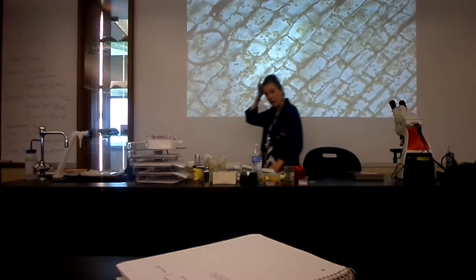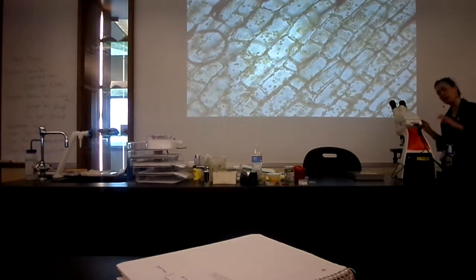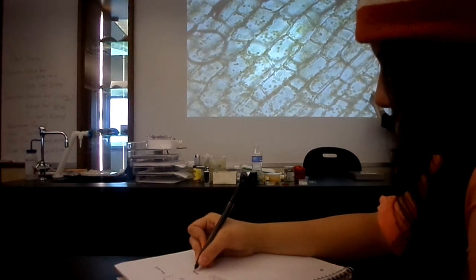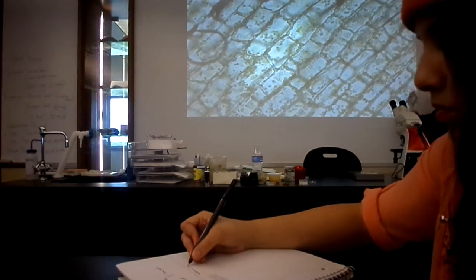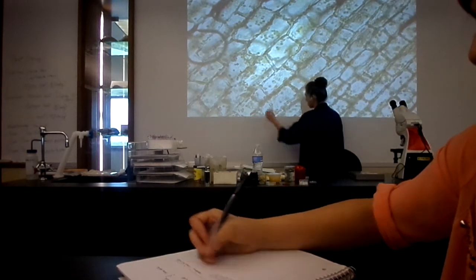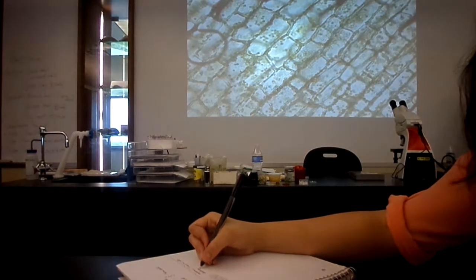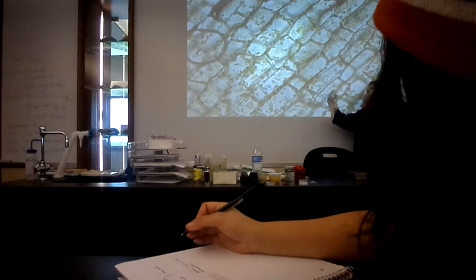All right. So what we're looking at here is an epidermal tissue, but it's also photosynthetic. So it pulls double duty. Now, what are the little green spheres that are moving around? Those are the chloroplasts. So those are the photosynthetic part. The chloroplasts are the little tiny green spheres that you see there. All of the material that you see that's moving throughout there is the cytoplasm.